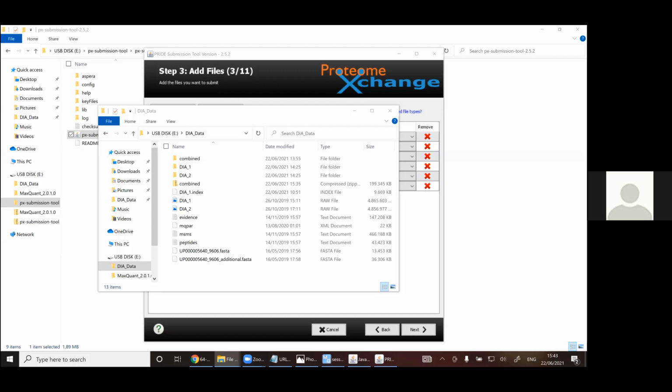Yes, my question is, do I select match between runs for a DIA run? No, match between runs, as explained by Pavel in the previous talk, you should not. That concept does not exist in DIA analysis, and that's basically being taken care of by the transfer Q value. So you don't turn that on.